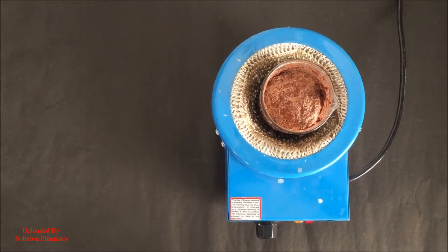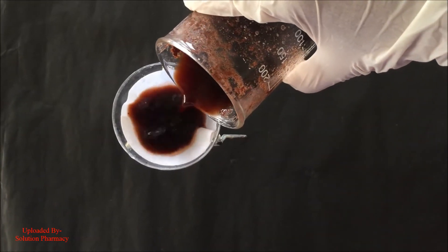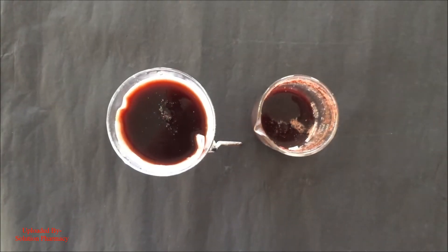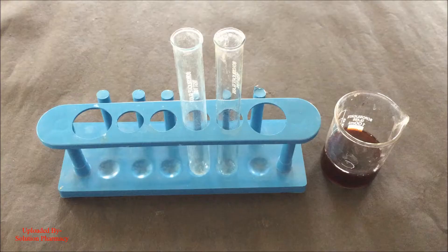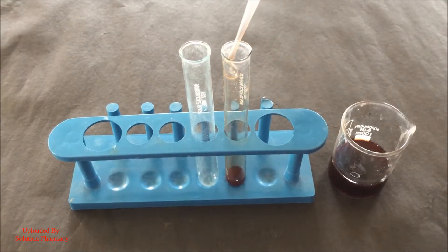After boiling, filter the content of the beaker through the normal filter paper to remove the residue and to collect the aqueous extract below into the beaker. After filtration, take the aqueous extract of the arjuna bark and with the help of a dropper transfer 2 ml of the aqueous extract into the test tube.